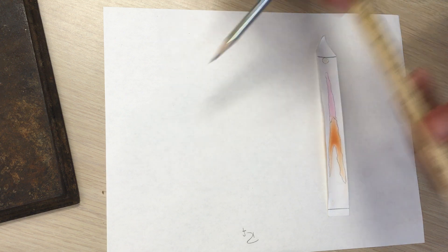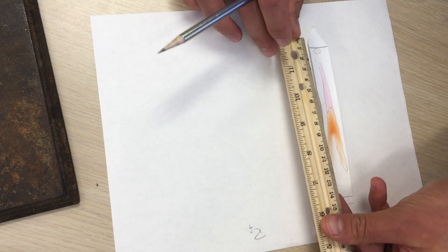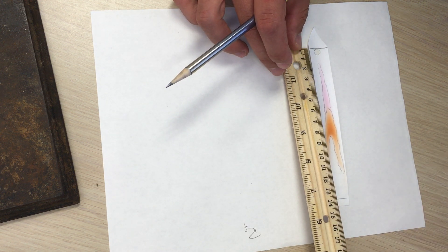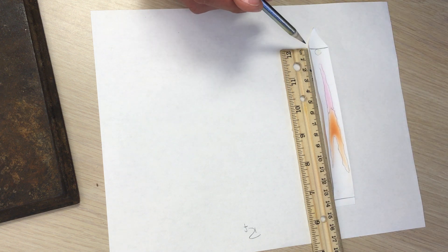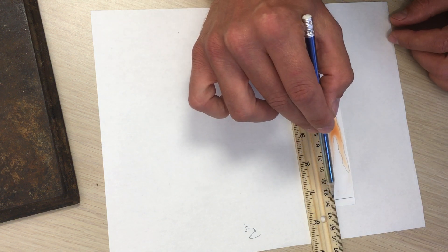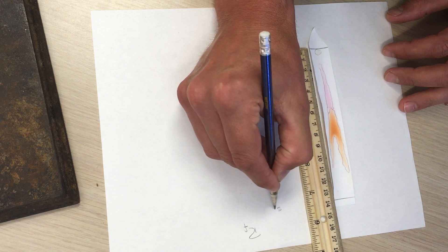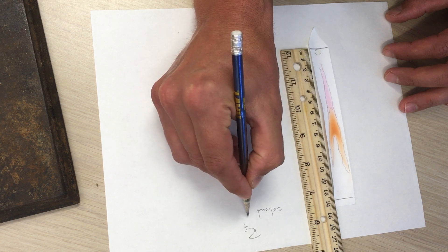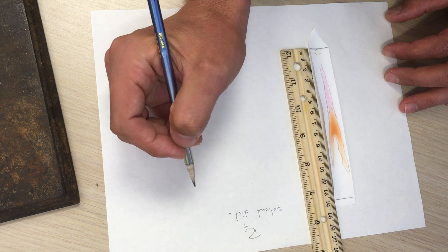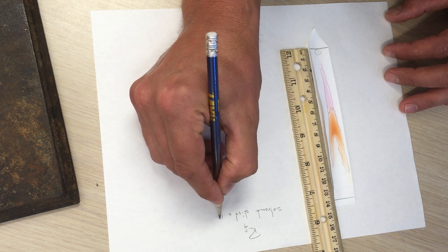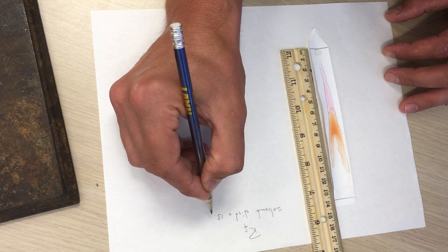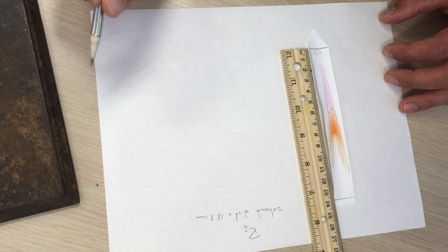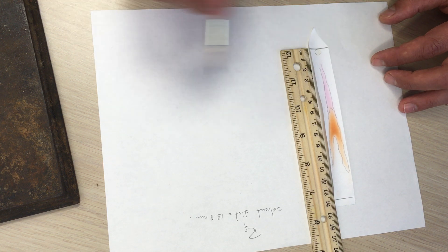So we measure from the line where the dye started from to where the dye ended. And so the solvent, not the dye but the solvent, the solvent distance is in this case 13.8 centimeters. And then we look at the distance that each component color traveled.